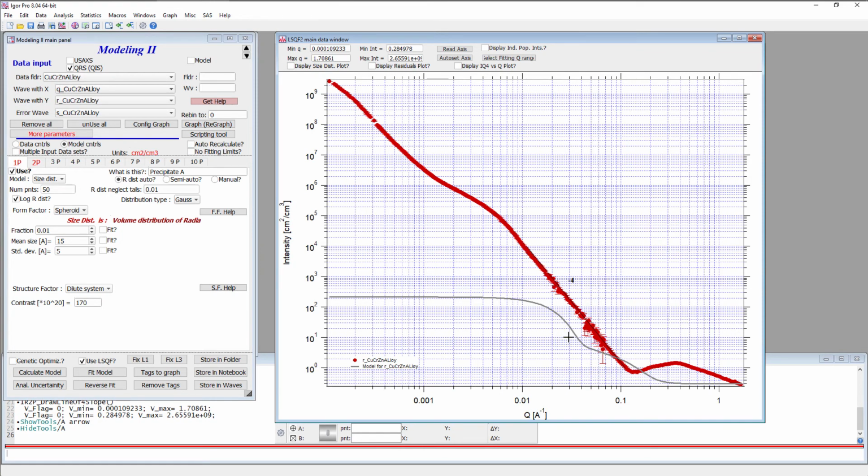If anything, this may be buried in here. It would be difficult to prove if it's there or not. So it may be there in some sensible volume fraction. But this, if it's present, has to be in a much smaller volume fraction than what we see. In other words, there's a lot more other scattering in this sample, which makes it impossible to simply see these precipitates or whatever particles the user expected.